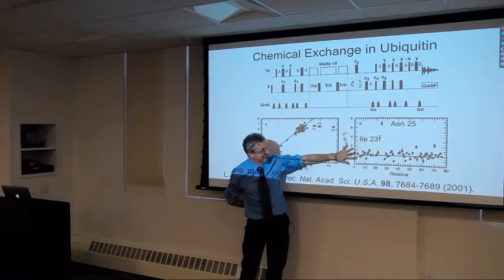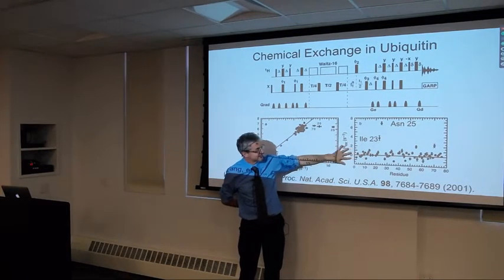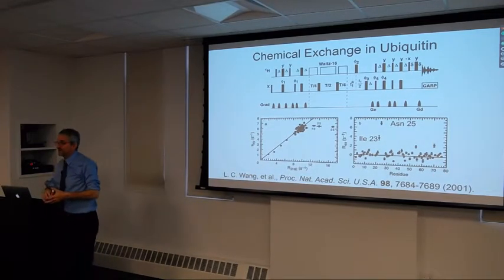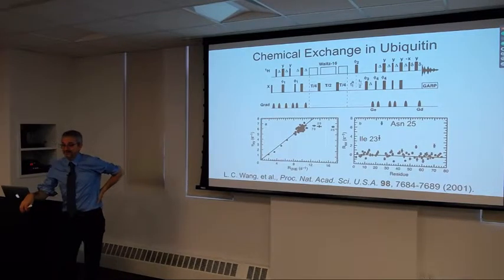One problem is, what does this scatter do to? So if you look back at what we talked about relaxation interference, the relaxation interference rate constant depends on delta sigma, the chemical shift anisotropy. And these data were analyzed using an average value for the chemical shift anisotropy. But of course that varies from site to site in a protein. Different backbone amide sites have somewhat different chemical shift anisotropies, and we usually don't know what they are.